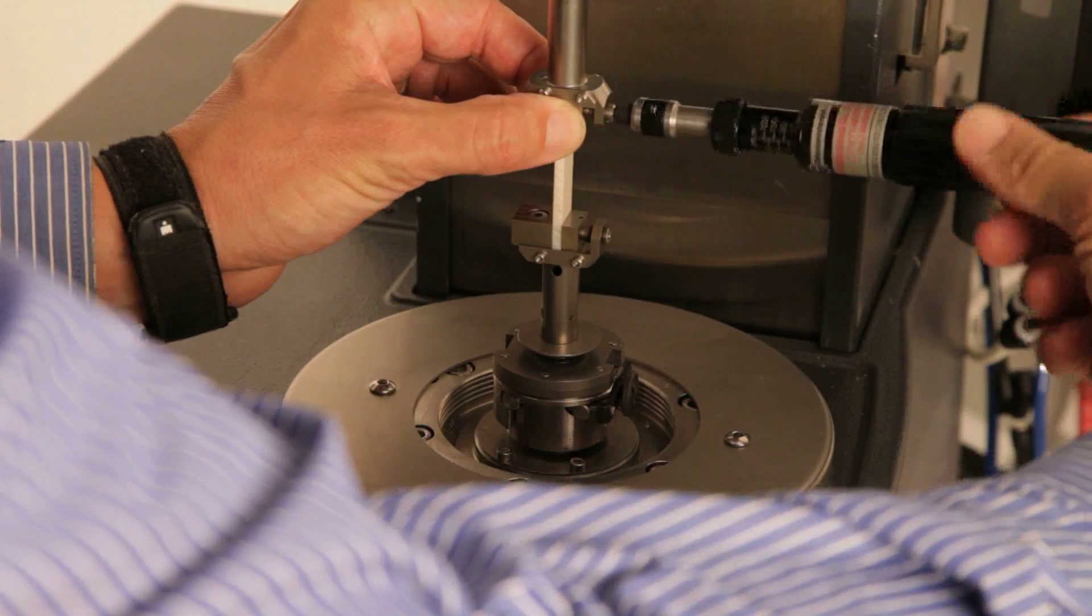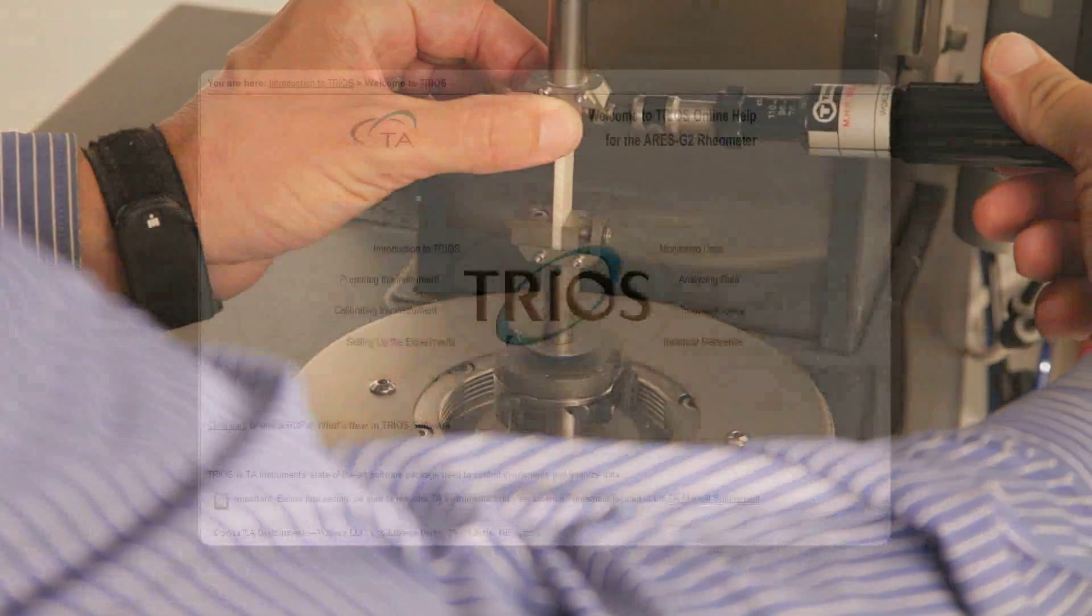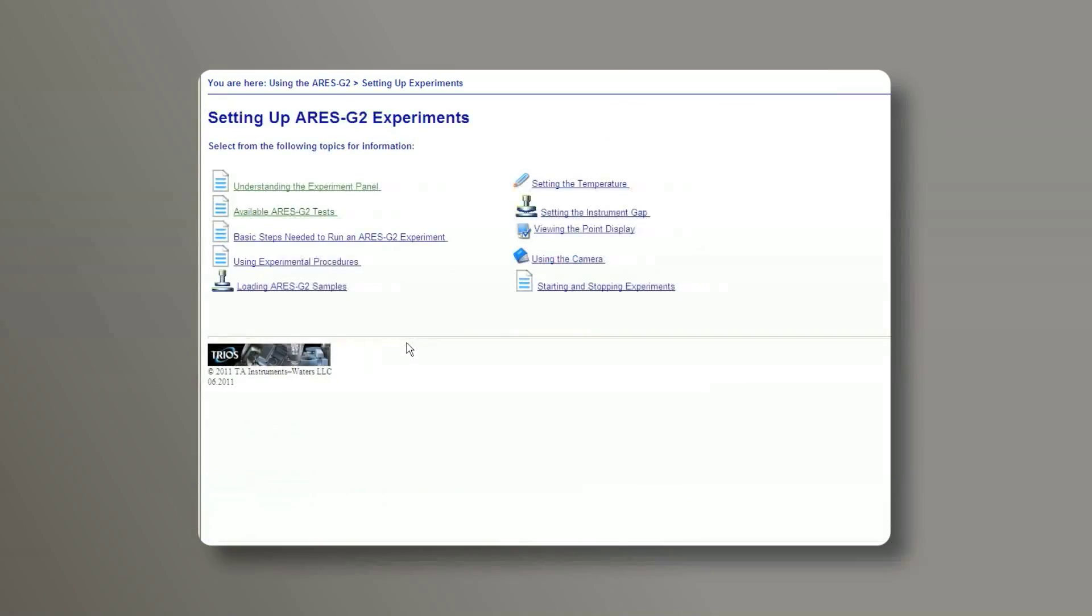Now tighten both clamps to the appropriate torque for your sample. A torque tightening guide is available in the TRIOS help.